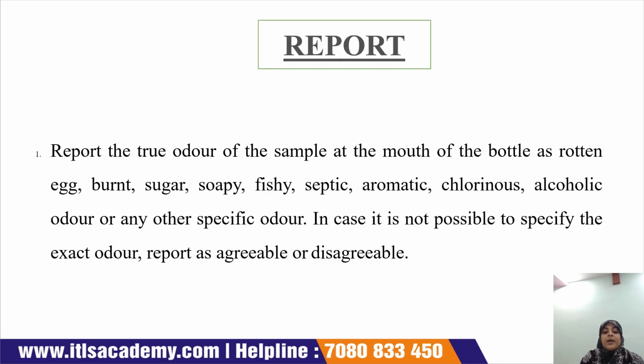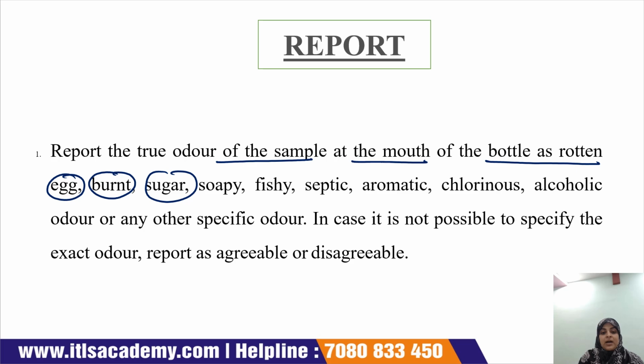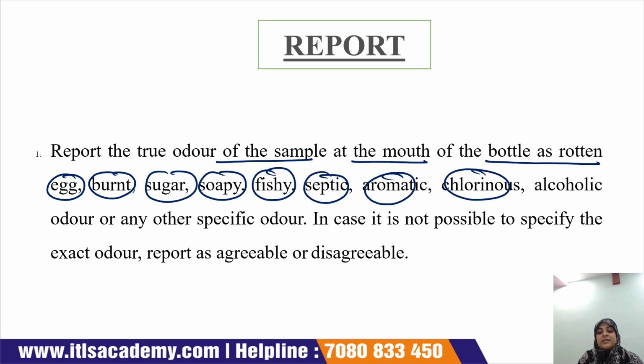Now report the true odor of the sample at the mouth of the bottle as rotten egg, burnt sugar, soapy, fishy, septic, aromatic, chlorinous, alcoholic odor, or any specific odor.